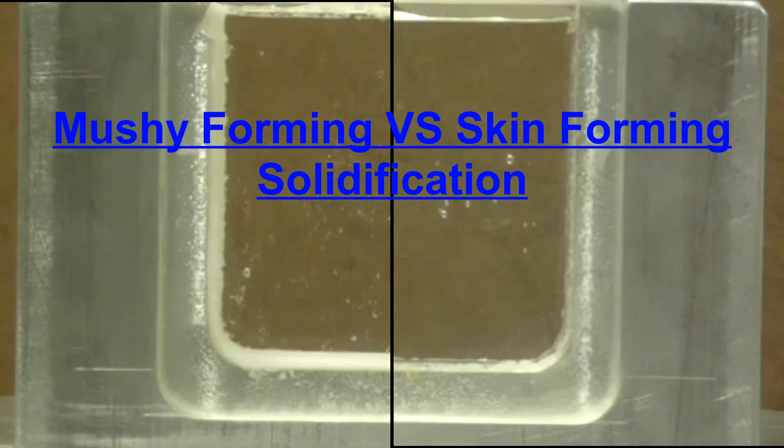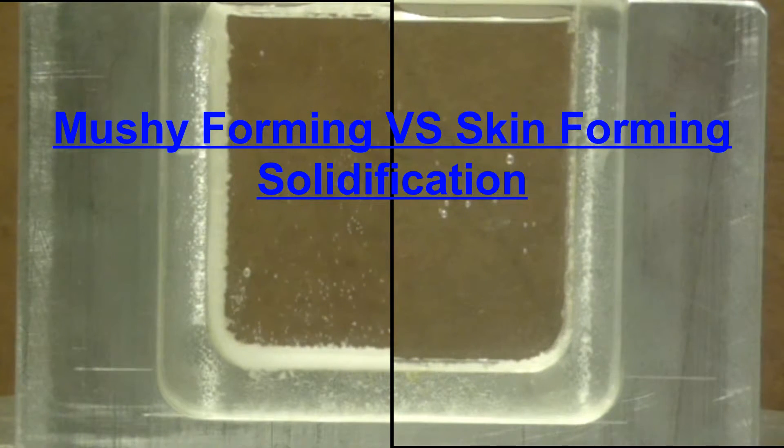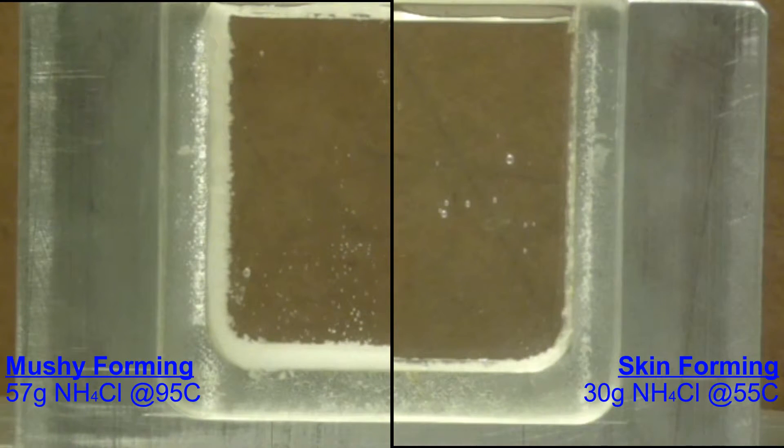Hello, this is Dr. Robert Tuttle at Saginaw Valley State University, and today we're going to compare the solidification of mushy-forming versus skin-forming alloys using our ammonium chloride-water mixture.